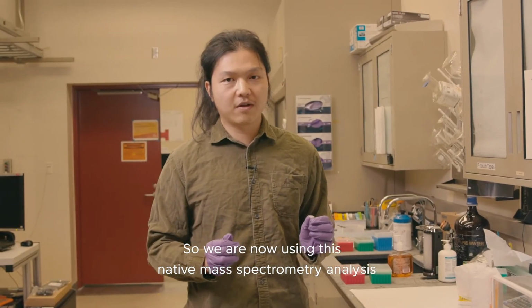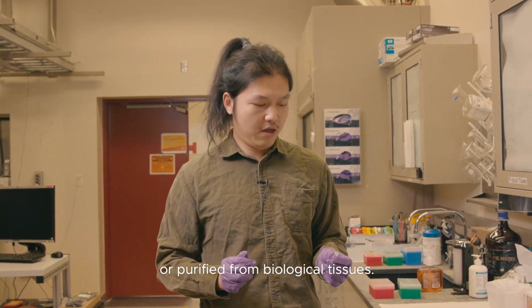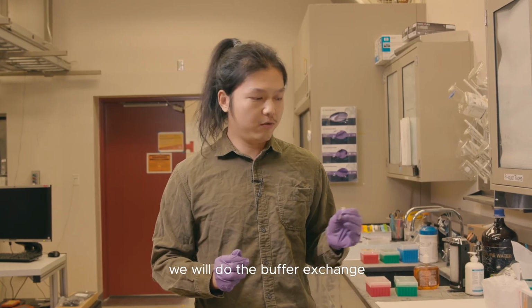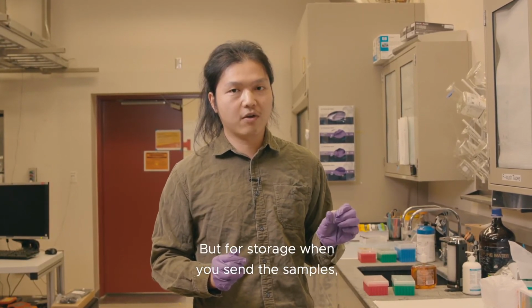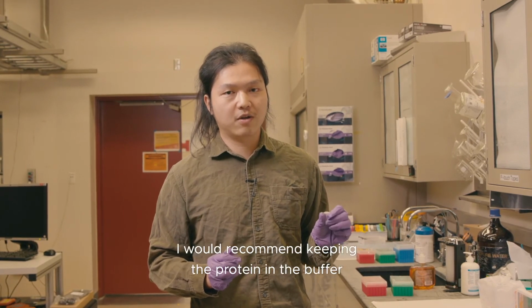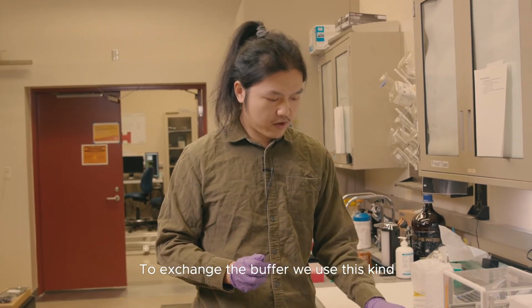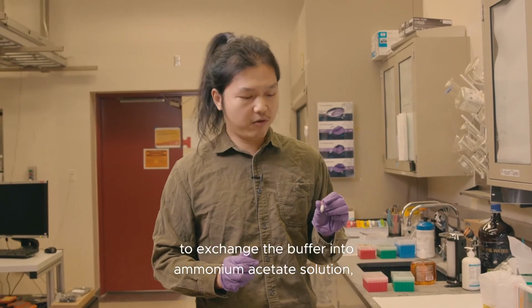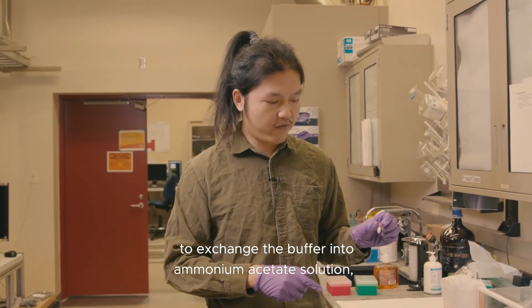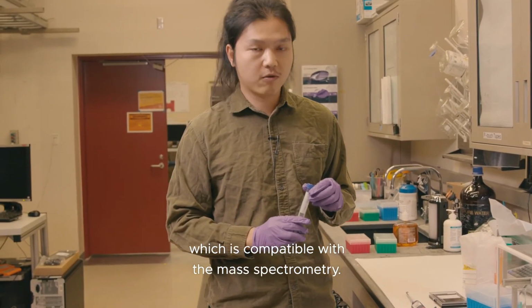So we now offer this native mass spectrometry analysis for purified proteins. They can be either recombinant or purified from biological tissues. When we receive the sample, we will do a buffer exchange to make it more compatible with mass spectrometry. But for storage, when you send the samples, I would recommend keeping the protein in its buffer. That's best for stability. To exchange the buffer, we use size exclusion spin columns to exchange into an ammonium acetate solution, which is compatible with mass spectrometry.